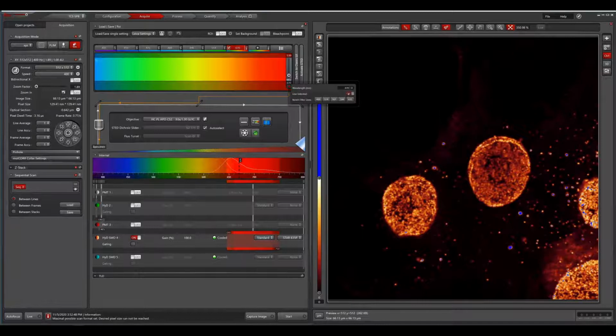And you can do that with a precision of 1 nanometer, and actually also choose up to 8 different excitation wavelengths at the same time. Right now, I'm of course working only with one dye, so I can remove the additional laser lines and just optimize my excitation laser to the dye that I'm working with right now to make sure that I really optimally hit it at the peak of its excitation, which on the other hand allows me to really use as little laser power as possible for this dye.